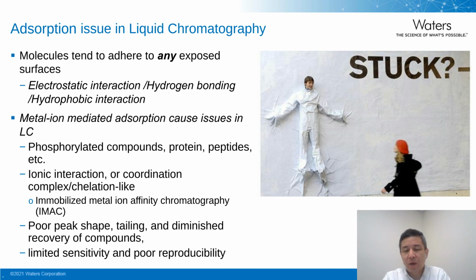So the detrimental effects of this adsorption can be poor peak shape, peak tailing, and diminished recovery of compounds, and often result in limited sensitivity and poor reproducibility in LC analysis.